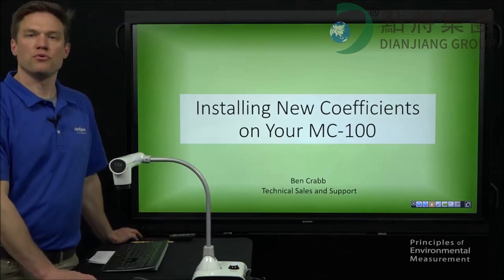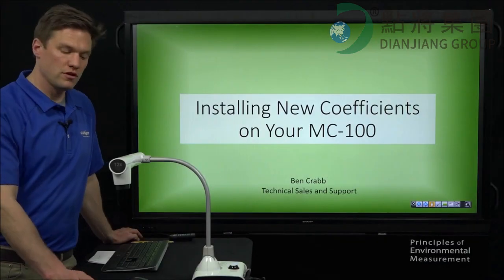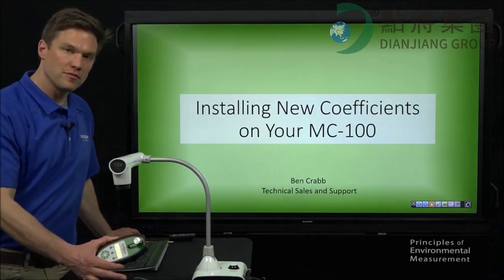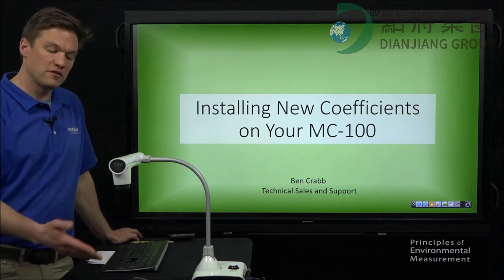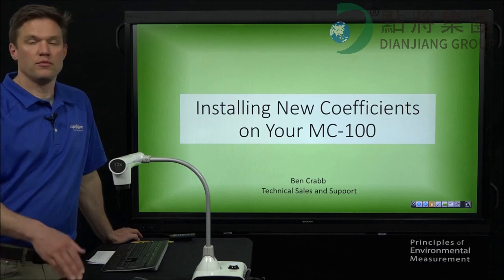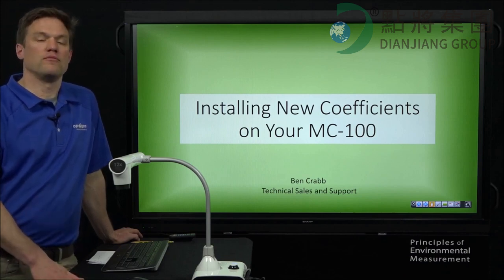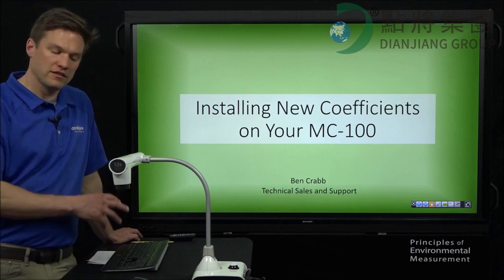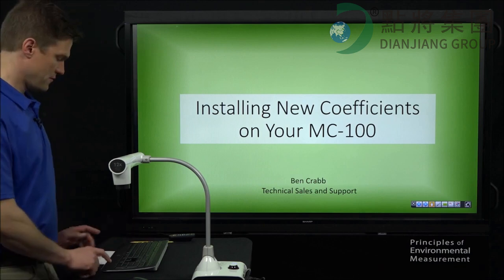I do technical sales and support here at Apogee Instruments. Today I'm here to talk to you about the process to load new coefficients onto your MC100 chlorophyll concentration meter. What inspired this process is that we have some new coefficients for cannabis and for grapes. But in the future, as we have new species with new coefficients, you can use the same process to access those new files, add them onto your meter, and get the most accurate measurements you can.